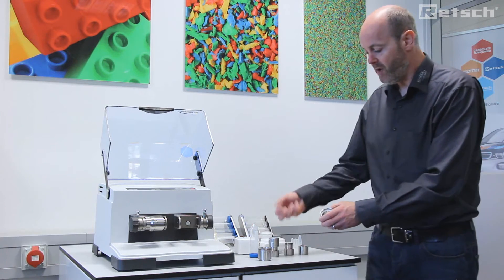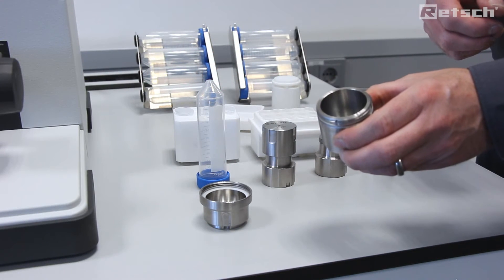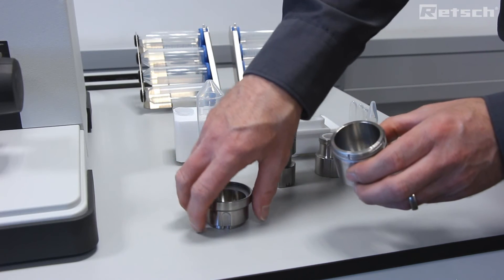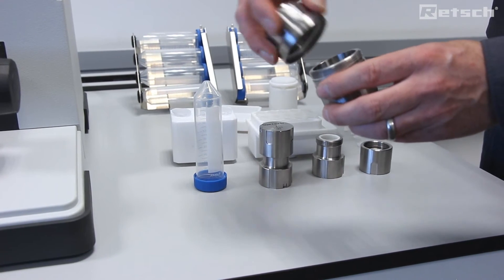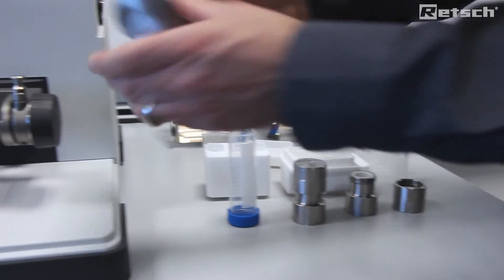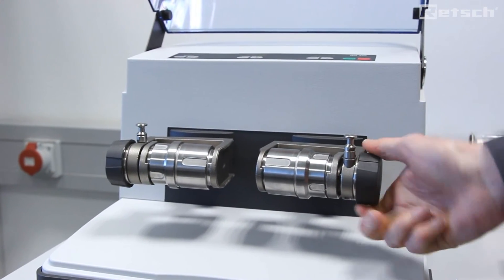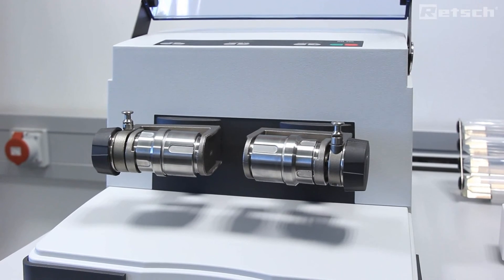Here we can see the grinding jar. Add the grinding ball, which should be approximately one third of the total volume. The second third should be the sample material to be prepared, and the final third should be free space to allow movement of the ball, which is important. We simply secure the screw top lid like this, add it to the mill which is automatically self-centered, tighten and activate the anti-rotation ratchet. Then we're ready to go.